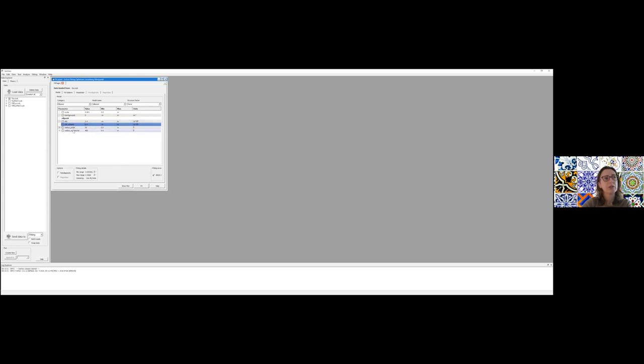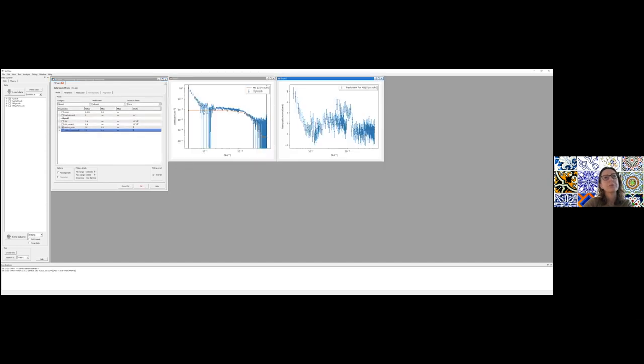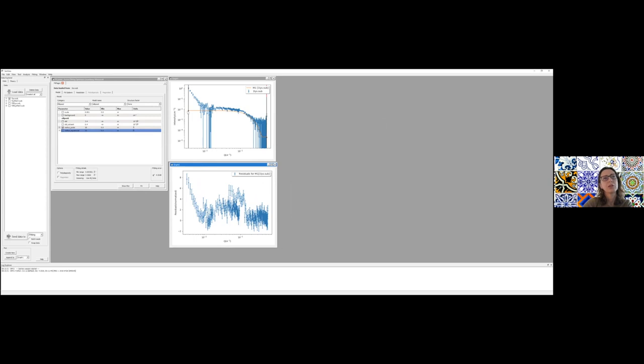And then you have this ellipsoidal polar and equatorial radius. And for lysozyme, and I give you that in the instructions, for a first approximation, you're going to leave that at 20. And you're going to put the equatorial one at 10, just as a first starting parameter. And I'm going to tick the polar radius. I'm going to say that I want to have a look at that one. So it'll be the only parameter that it will fit. So you just click on show plots so that you can see what the data looks like. You have your data here in blue. In orange, you have what the model looks like. So it hasn't calculated a fit yet. This is just the calculation that it has done from the parameters that I've input.